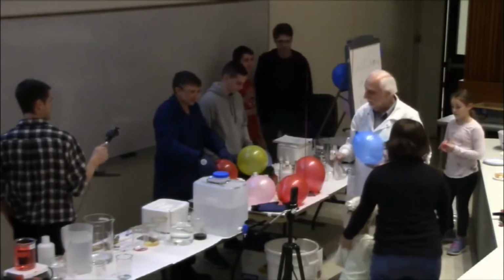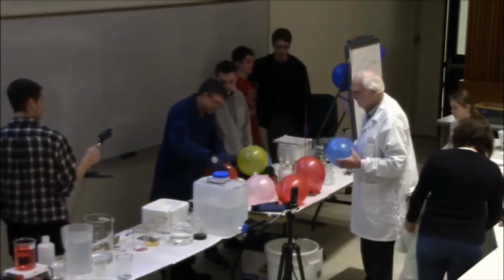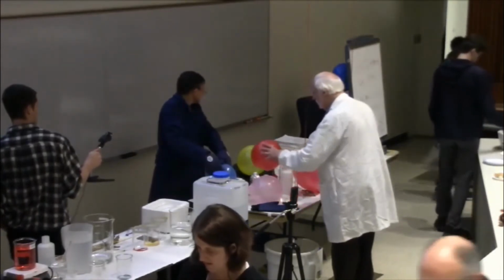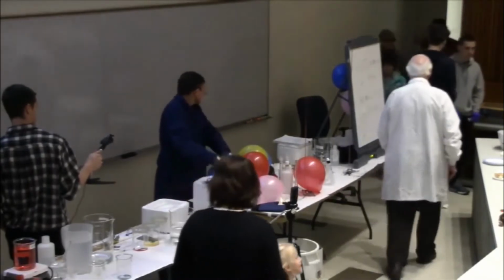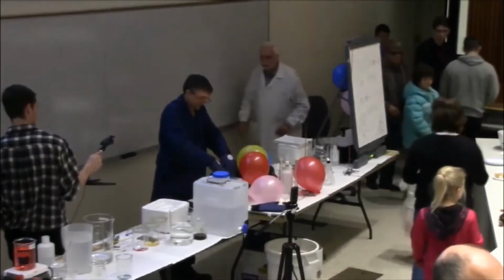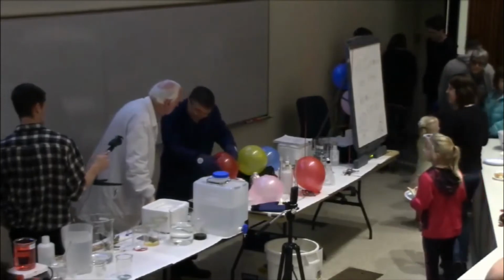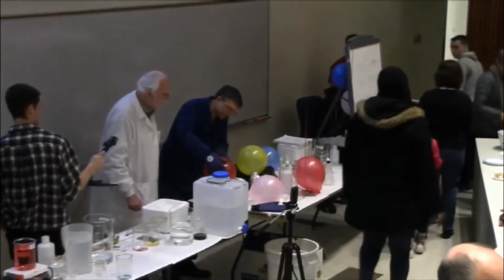Carbon dioxide blew it up in the burst. Do we have any other balloons? No. I'm not going to give it another shot. Liquid nitrogen. No, this is enough. That's enough? This is enough. That's a lot of it.